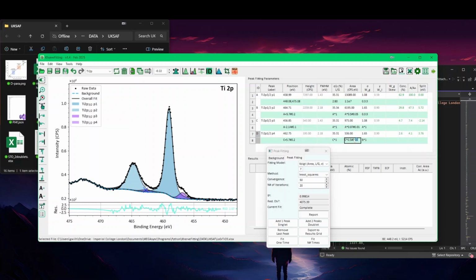You can do the same for C if you like, and make it in function of B. So if I type B, it will make it in function of B now. But let's make it in function of C, because that's usually the way for a doublet. So something like this. And as you can see, it actually went to 0.55.